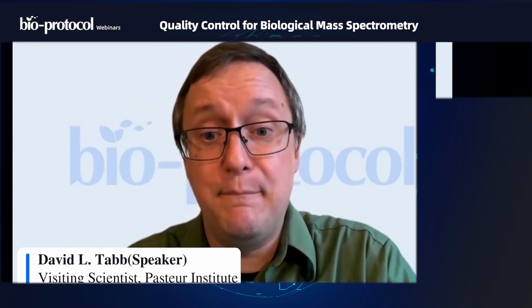When you are conducting a large-scale experiment that spans many weeks of time for the instrument, you really need to be very careful of what's called a batch effect, which is to say that if you queue up samples for a month and then start them shooting, collect samples for another month, and then send those over to the lab for shooting, and then collect samples for the 3rd month, and then send those over to the lab for shooting, you are quite likely to see that the experiments from batch 1 cannot be compared to the samples from batch 2 or from batch 3.